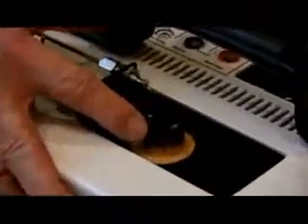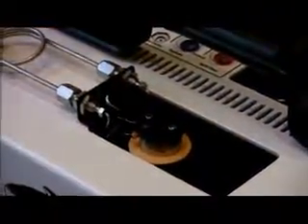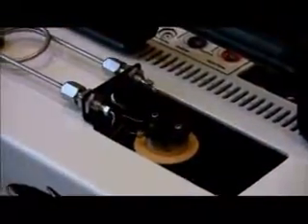This is a normal syringe through a septum style injection port. It is a rather normal inlet with a glass liner that can be packed or not packed depending on the application requirements. It is a bayonet mount style so that it's pretty easy to change the septum. Simply loosen these Allen wrench screws with some thermal gloves. If it's still hot, twist it, lift it off, and easily replace the septum.